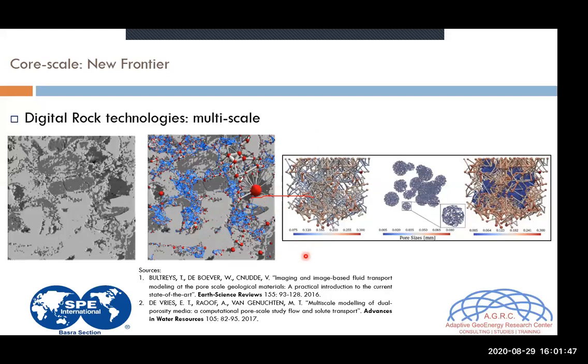But then there are some numerical or at least some modeling approaches that are possible just using the digital rock approach. One of them I took from the reconstruction of these micro pore systems, how they are changing the permeability of the system. So it's just a possibility using digital rock. It's like an R&D analysis here. It's just to give an overview that we can perform several acquisitions at several scales. It's a really important point.